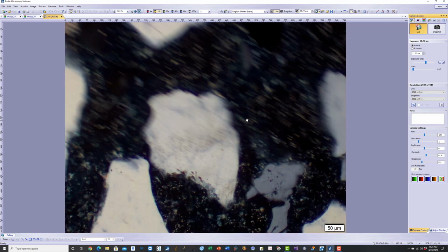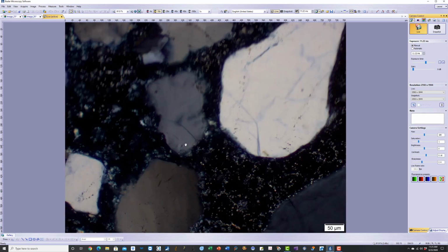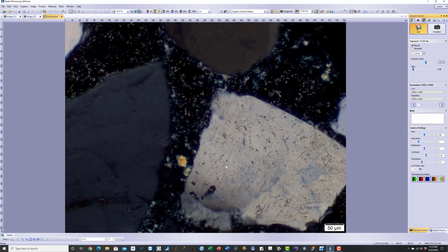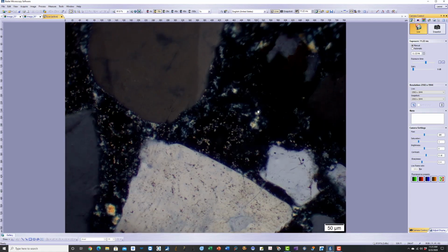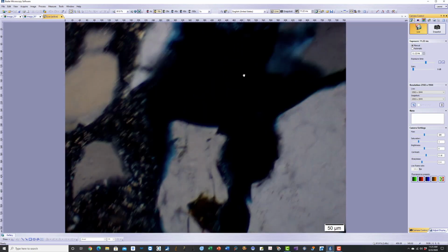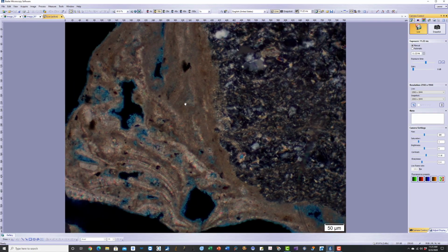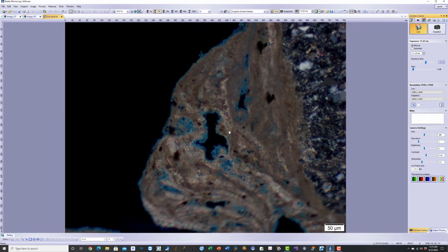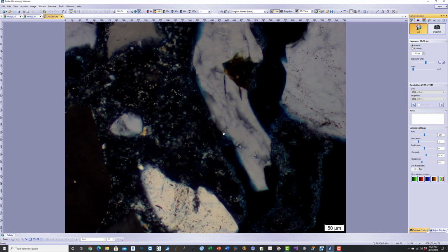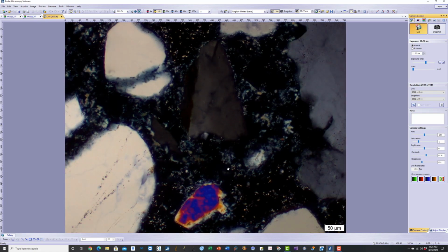and the calcium silicate hydrate of cement hydration product and the calcium hydroxide component of cement hydration product has been leached out partially, because you still have some calcium hydroxide crystals left. Partially it has been leached out by the migrating moisture and formed calcium carbonate, either carbonated paste or the calcium carbonate efflorescence at the surface. The ingredient of the efflorescence deposits came essentially from calcium hydroxide component of cement hydration and calcium silicate hydrate.